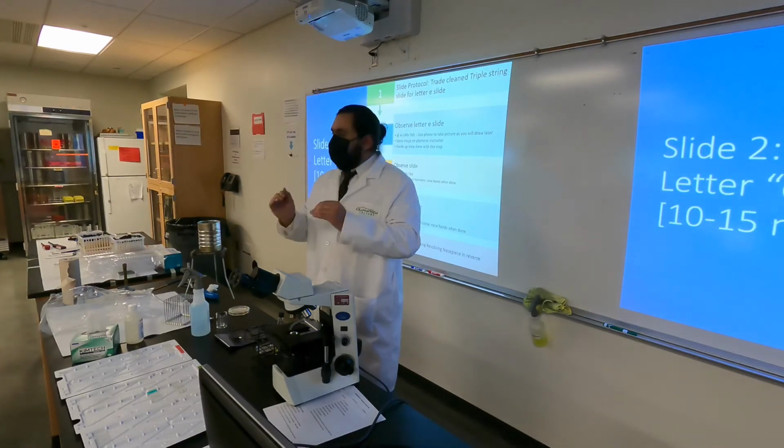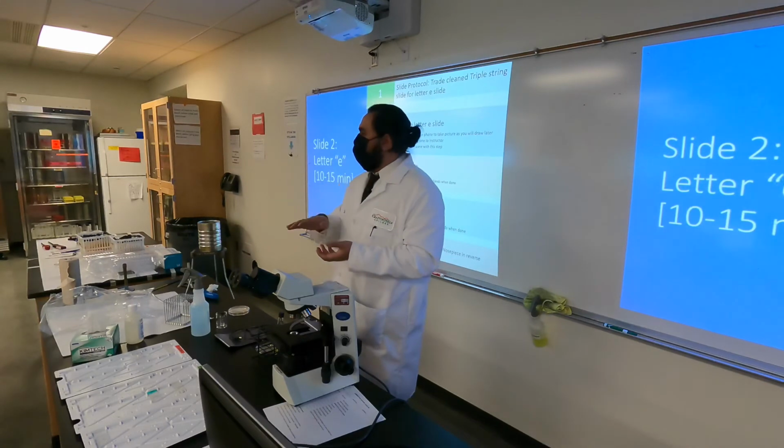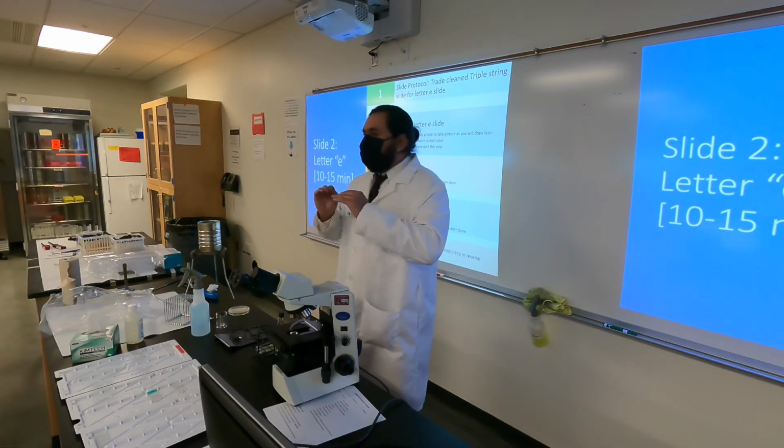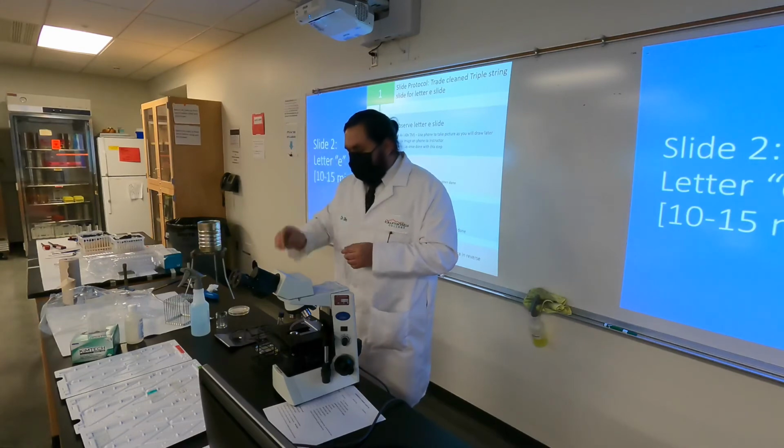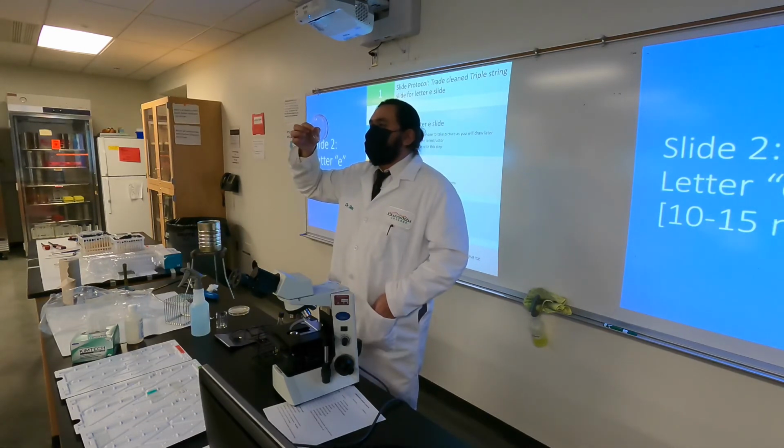Nice, even. Now, what's gonna happen is because it's fairly thick, it's not gonna cover the whole plate. So you're gonna have to rock the plate a little bit, gently. And what I mean by gently, your plate might move, let me show it to you perpendicularly, like a little bit like this.